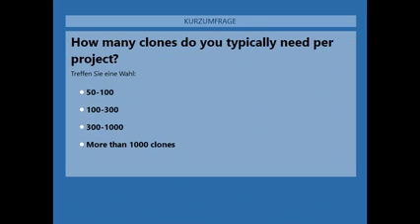So I believe for a typical project, most people are looking for a few hundred clones, but this can really vary a lot depending on the product and also the transfection method, obviously. So I'm super curious to see what is your take on this.